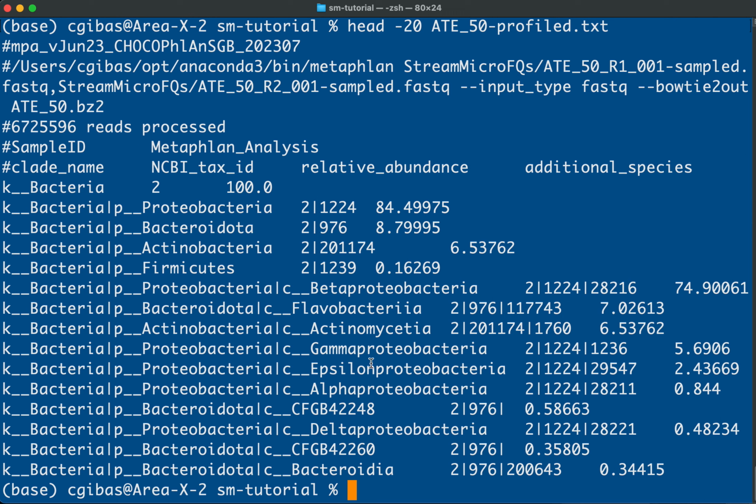And what we usually want to do with metagenomic analysis is we want to make a figure, right? We want to make one of those stereotypical stacked bar charts that everyone has. And we don't do that with all of this data. We only do this at a specific taxonomic level. So you might see a phylum level classification, or a family level classification, or genus level classification, but you won't see that all mixed together, and we have to be able to filter that out.